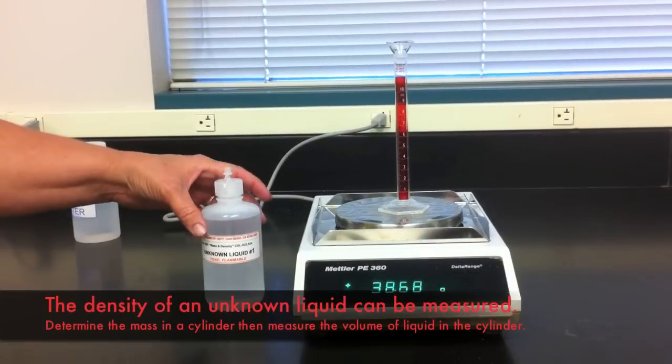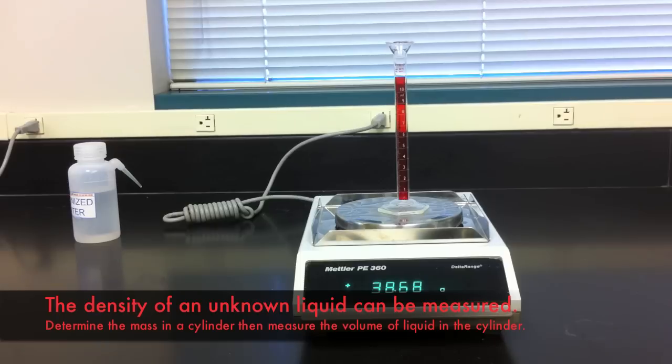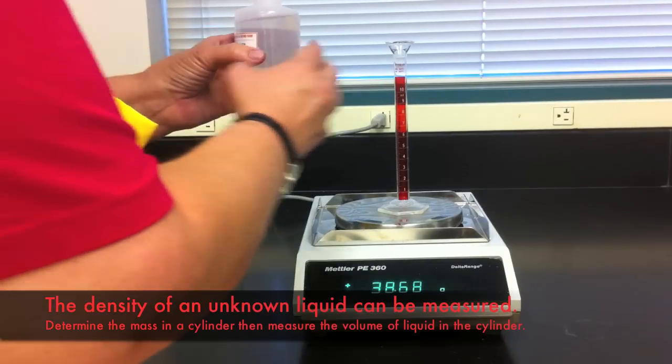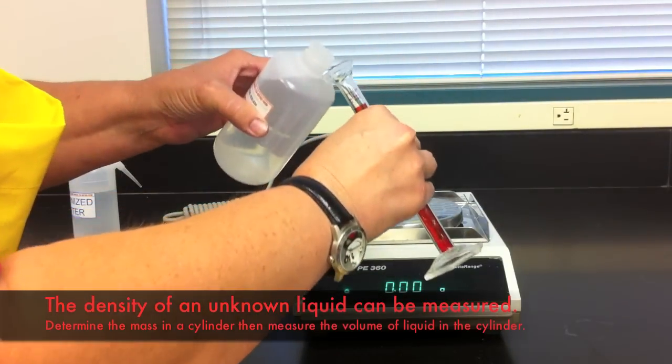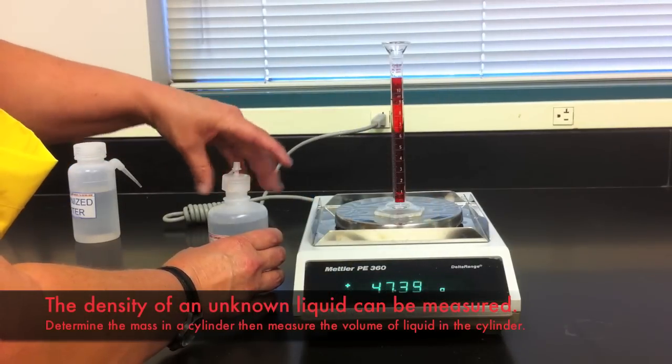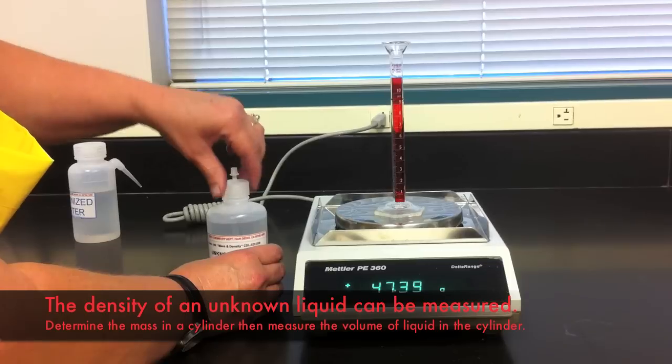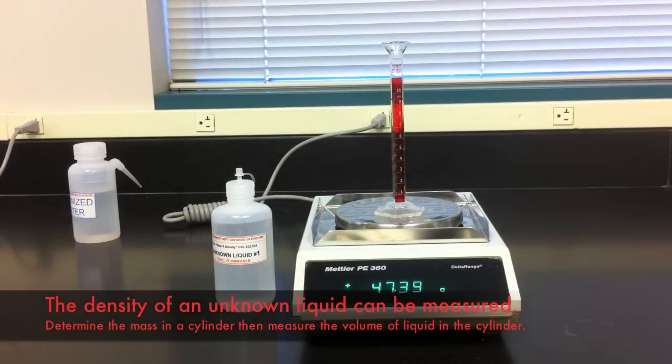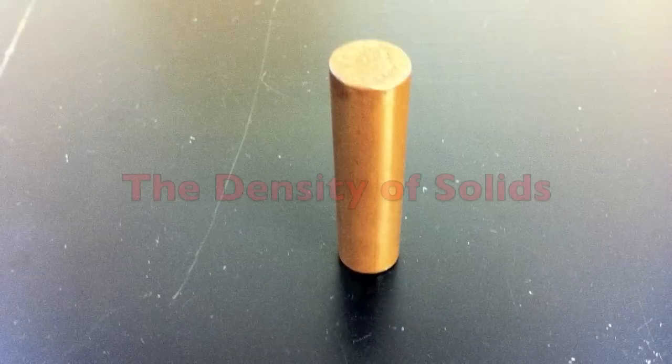To determine the density of an unknown liquid you will first need to record the mass of a dry empty graduated cylinder. Add a volume of the unknown liquid to it and record the volume added. Then finally record the mass of the graduated cylinder with the unknown liquid in it to determine how much mass has been added.